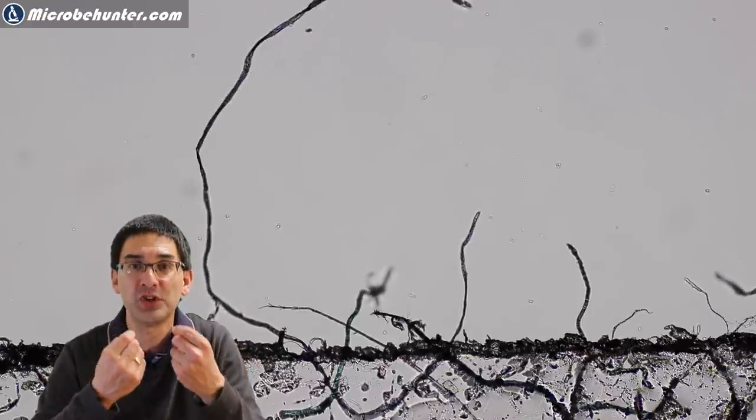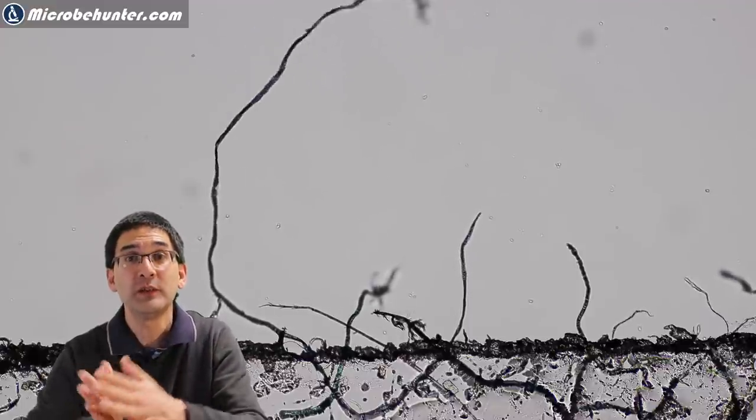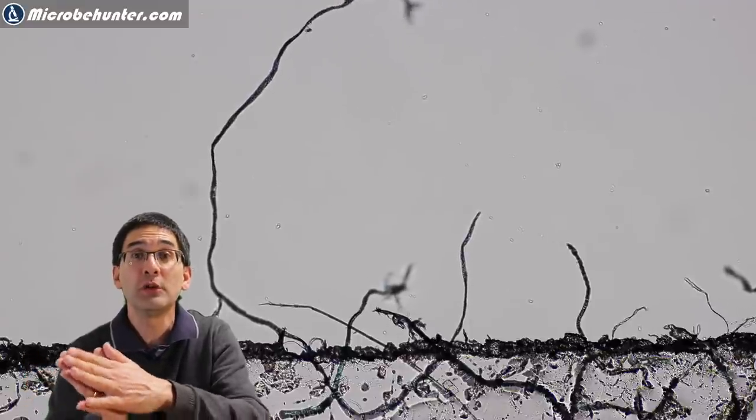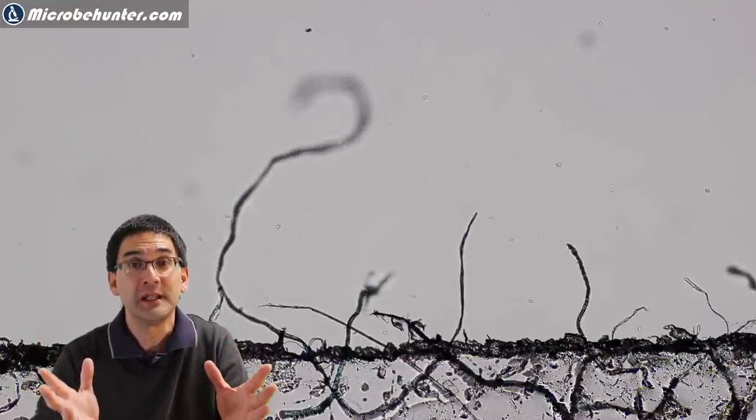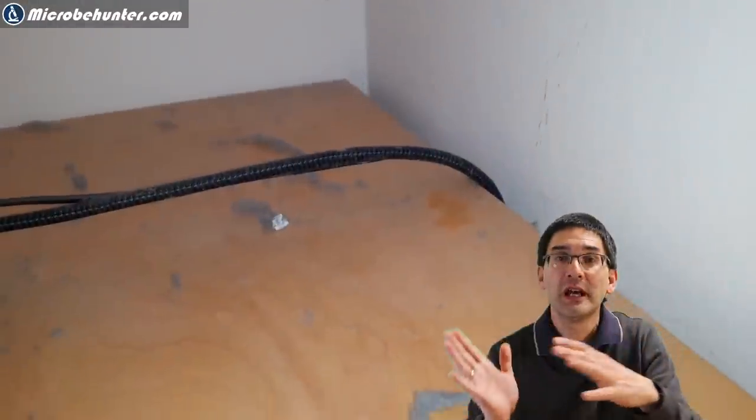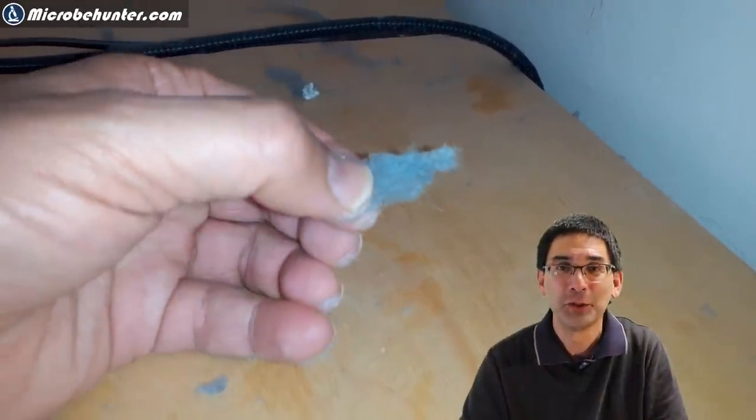And basically they will then move. And then when you stop breathing they will actually continue to move because they start to dry up again and by drying there are new tensions that emerge and then they will bend backwards.